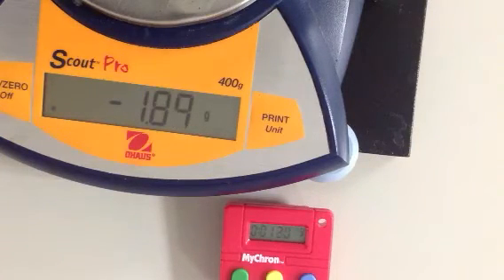Anybody making any qualitative observations? Gas. Smells. Color. Can you see the gas? What's the product gas? Oxygen. Can you see oxygen? Yes. Water. You can see water vapor, but you can't see oxygen. How do you know?